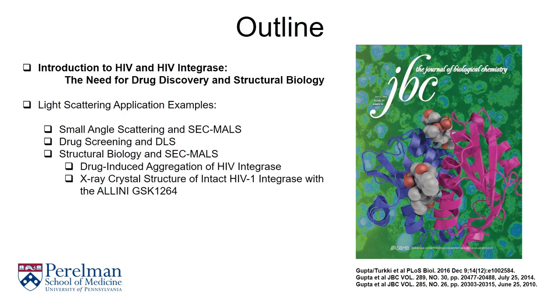I'll tell you a bit more about small angle scattering and how SEC-MALS has been important to its application to the study of HIV integrase and its complex of host factors and DNA. Then I'll tell you more about how dynamic light scattering has helped us assess prospective lead compounds that are hits against HIV integrase. This will then be followed by some discussion of how key light scattering was to our recent breakthrough in crystallizing the full-length intact HIV integrase protein with a new class of compounds called allosteric inhibitors of integrase, or ALLINIs.